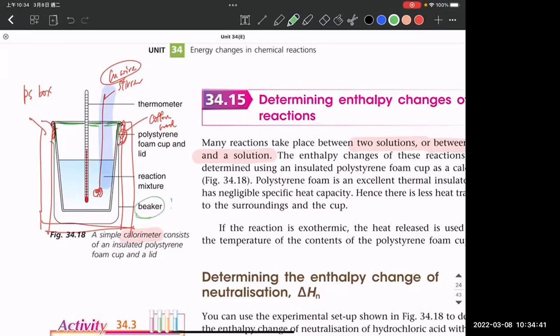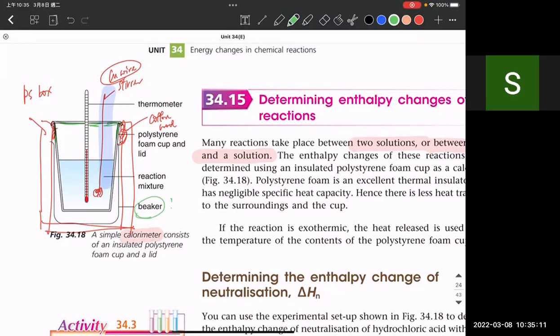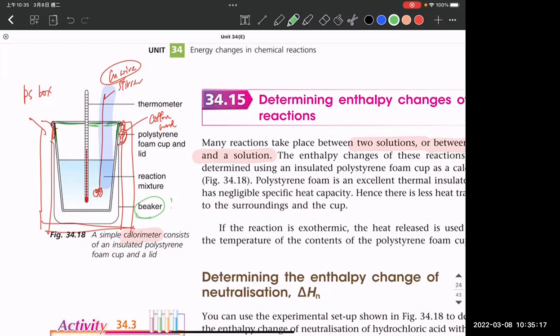But I would take a look at a certain angle, right? There may be some cotton wool, which is used to wrap the container inside. I do suspect that will be so, and together with it, right? So all those, what are the purposes of all those? Now, whatever design we are having, what are the purposes?